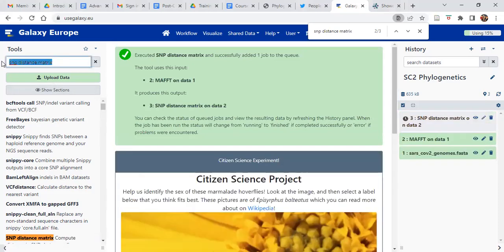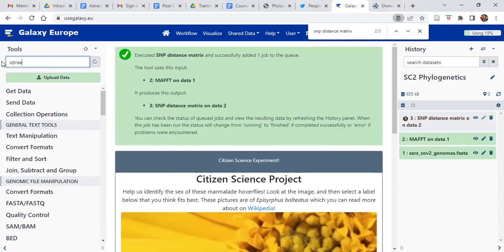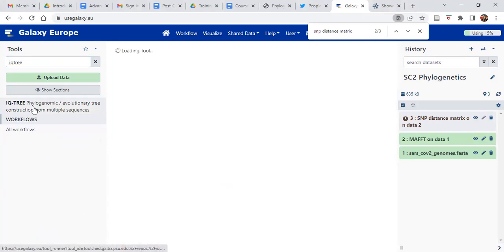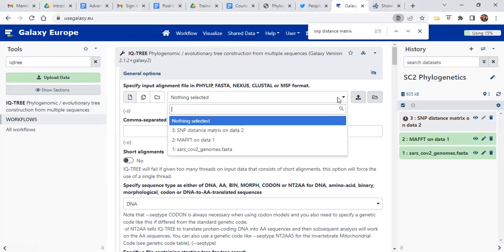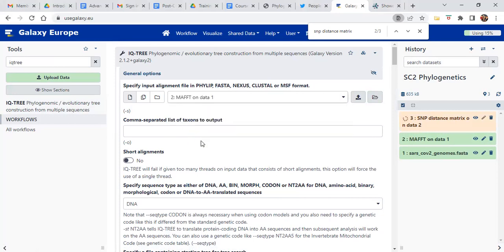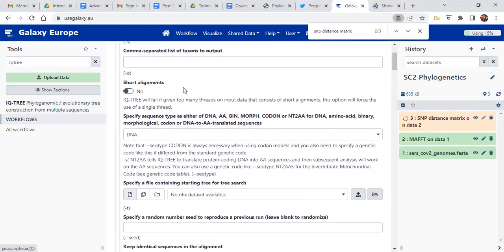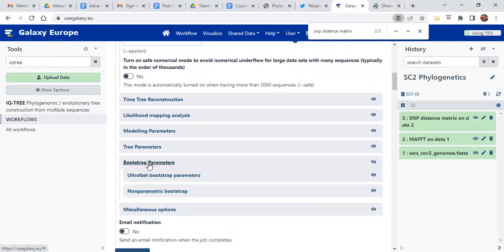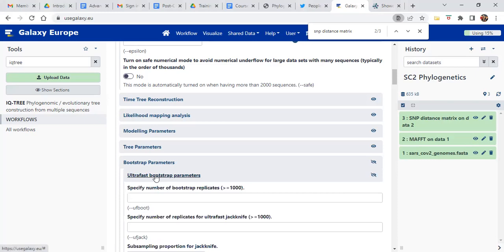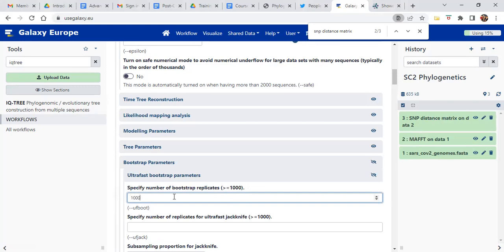While that's running, we can go to IQ-TREE. Click on the tool. IQ-TREE is not selecting a file automatically because it takes multiple different formats, so you'll have to select it yourself. Select the multiple sequence alignment file. Here we're going to change some parameters — specifically the bootstrap parameters. Scroll down and you'll see bootstrap parameters. Click on that and it will open up. We'll choose the ultra-fast bootstrap parameters and use 1000 bootstraps as suggested. That's the accuracy step where the tree is basically regenerated multiple times.